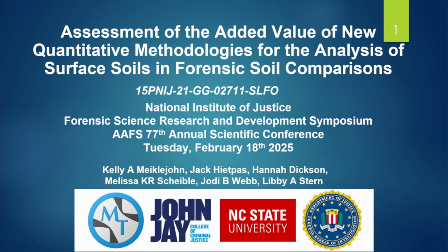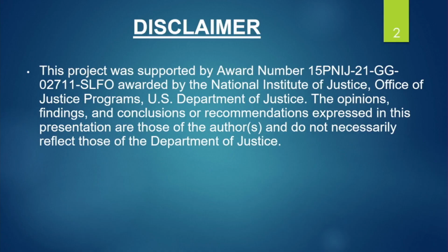Our project that we had funded by NIJ that started in 2022 is on the assessment of the added value of new quantitative methodologies for the analysis of surface soils in forensic soil comparisons. So the standard disclaimer here.